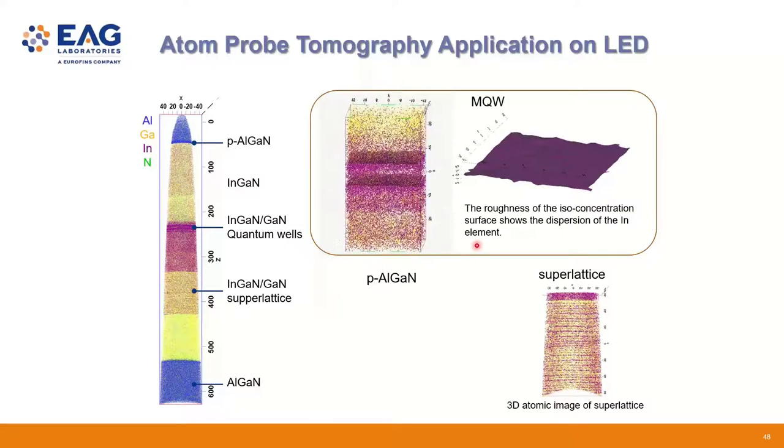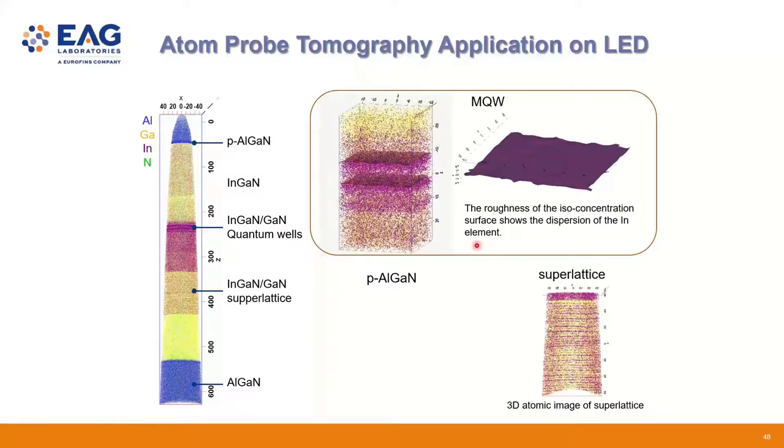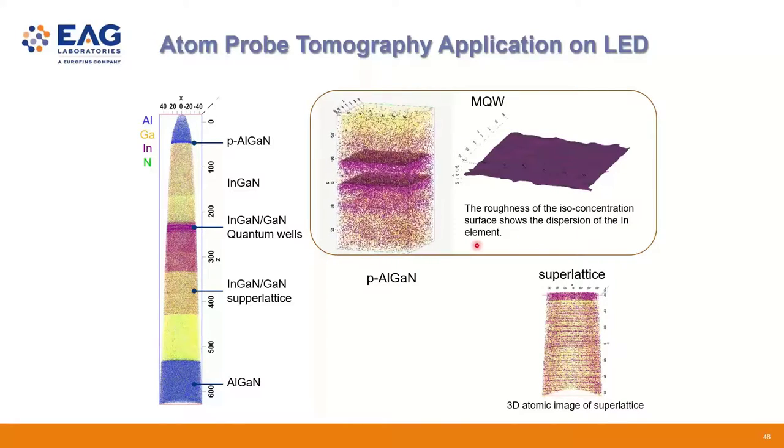Yeah, I think this is a great question, right? Unfortunately, atom probe is still not a universally applicable technique for many materials, or I should say many engineering materials. There are some publications about, for example, atom probe on silicon nanodevices. Again, as long as you integrate highly insulating materials, highly conductive metals, and semiconductor material together at the nanoscale, there's a lot of complication, right? So basically it's a case by case type of analysis.